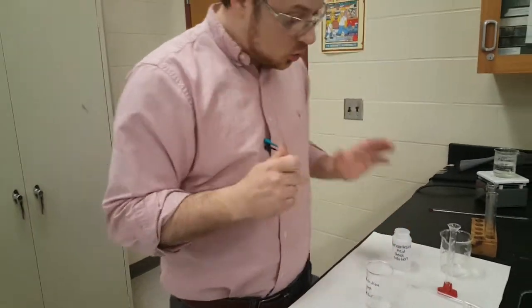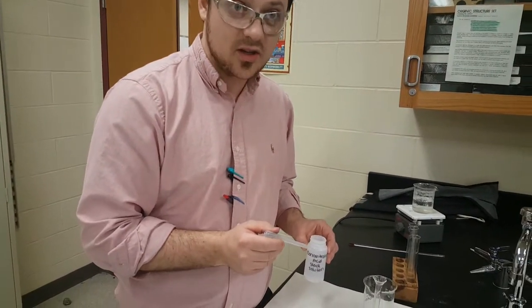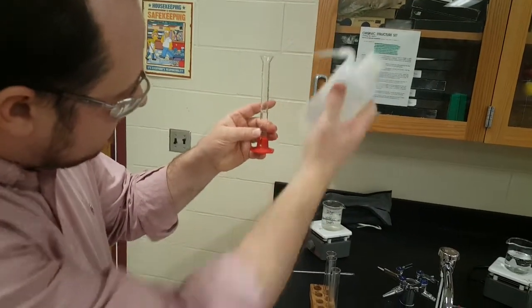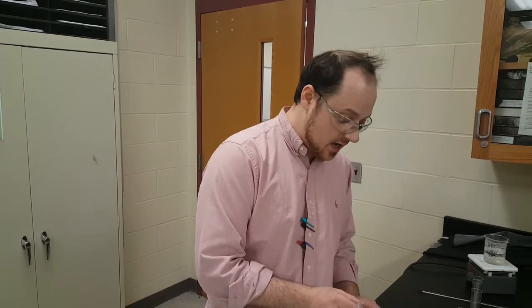So for the second trial in the first procedure, we have to take 15 mils of acid and 5 mils of water. Now, specifically, we're going to measure which one first, then? The water first. I want you to go to 5 for the water, add it to the beaker, because we always add acid to water. A comes before W in the alphabet. Acid goes into the water. Then you're going to measure 15 mils of acid. The first trial you did 20 mils of pure concentrated acid. This time you're going to do 15 and 5 mils of water. So you've diluted it by 25% or so.